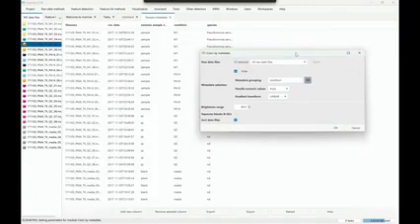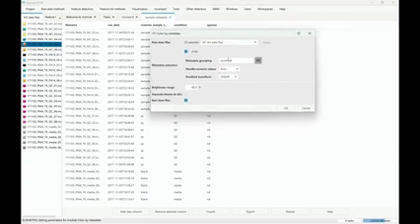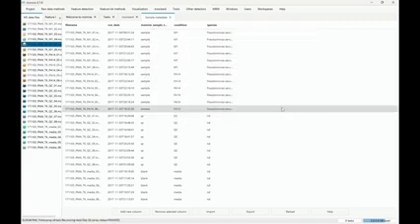It's going to bring you to the metadata, and in here, if you're missing condition or species, then maybe you didn't select the metadata file, but typically if you load it, you should have your personal metadata for your samples. So I will just do this. I have condition, I have the coloring, and then I will just hit OK.